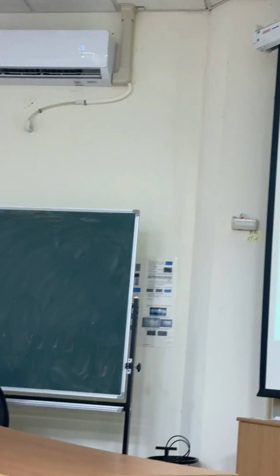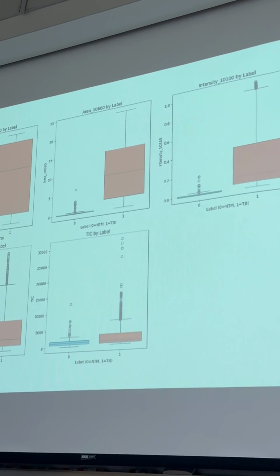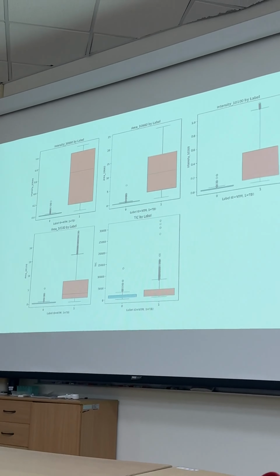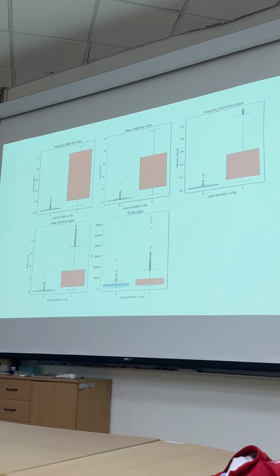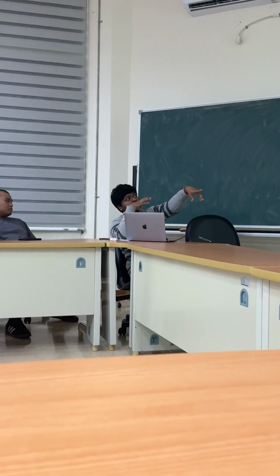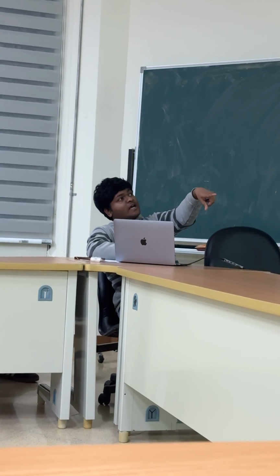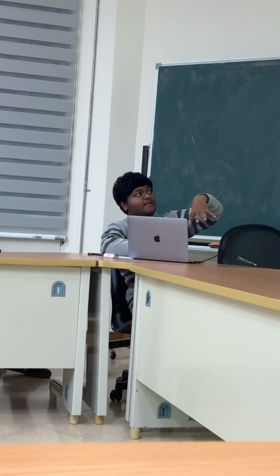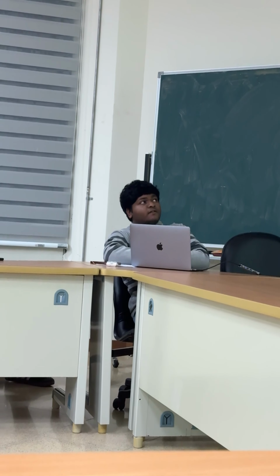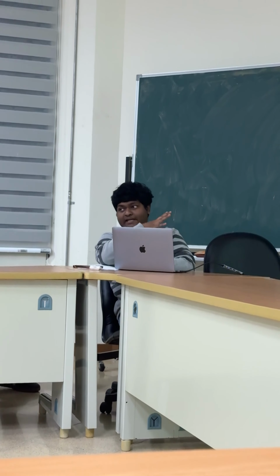For the intensity at the 10,660 peak, in NTM you can't see any significant intensity when you normalize, but in TB you can see a significant difference. And also the area after you put the Gaussian fit, the intensity at 10,100, the area at 10,100, and the total ion current. For 30 features you can plot, but since there is a space constraint, I didn't plot everything.